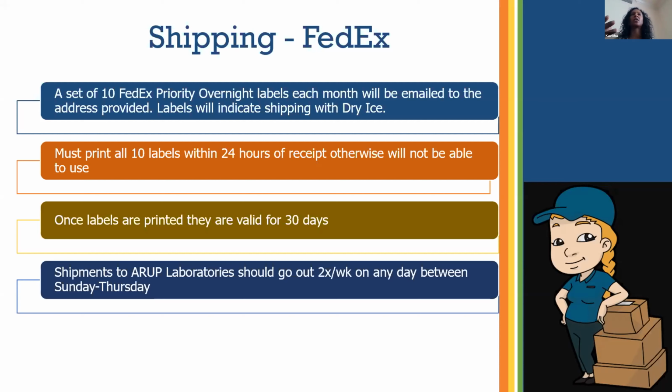If you have a package all set up to be shipped and FedEx for some reason cannot come, or they miss the cutoff time, we've had that happen a lot at our site, you cannot leave the samples in the dry ice just sitting there for the next day. You either have to somehow get it dropped off, or you have to take everything out and stick it in the freezer. You can't leave it on dry ice and have them pick it up the next day. You'd have to repackage it tomorrow.